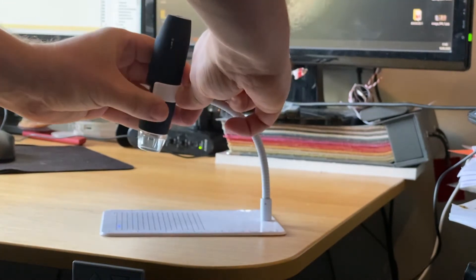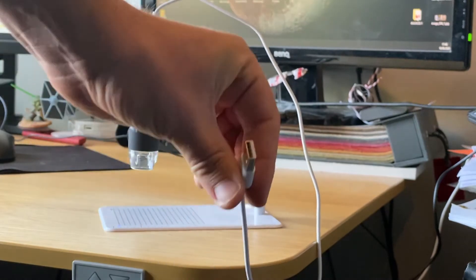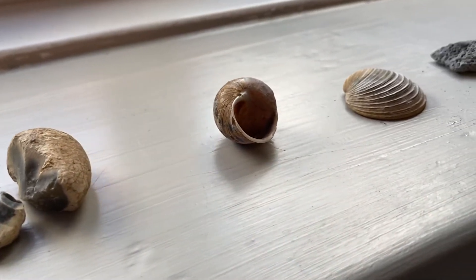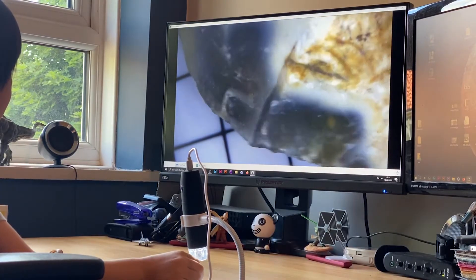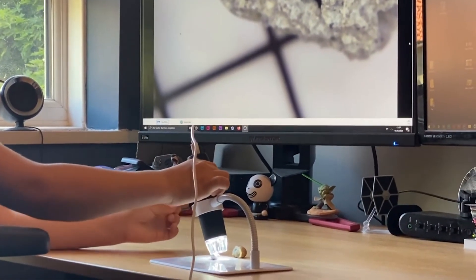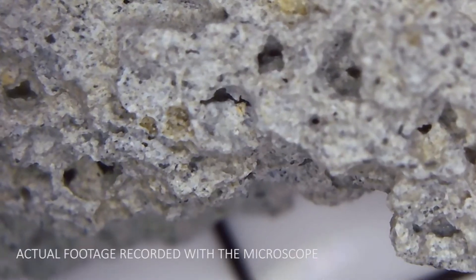You can attach the microscope — it really clips well in place. However, I found the white surface distracting at times; it's very reflective. When you blast those eight LEDs right on an object sitting on that reflective white background, it sometimes can look not great. It's better to use a little piece of paper or a black piece of cloth underneath. So then we went out and explored in the garden and found all kinds of curious objects — including what might be moon rock, or concrete. My son, who is five years old, operated the microscope all by himself, adjusting it very close to the object and spinning the silver wheel to adjust sharpness.